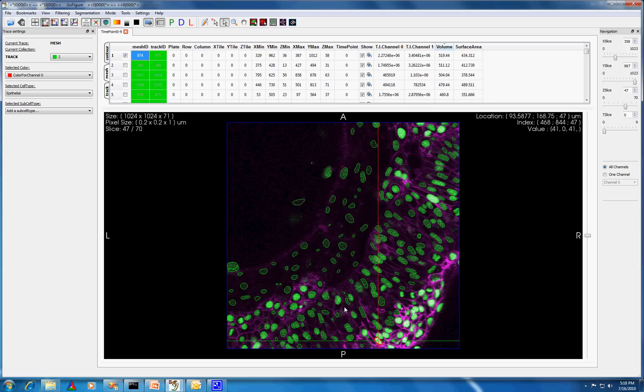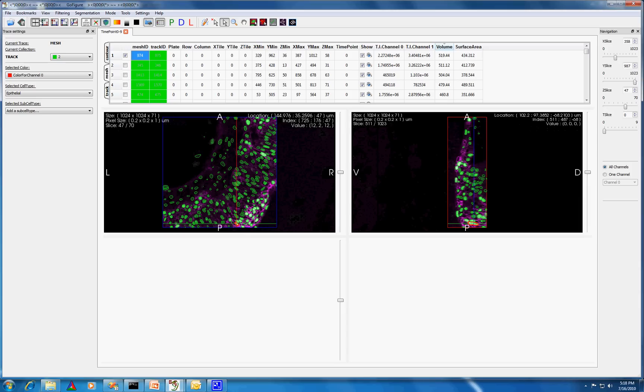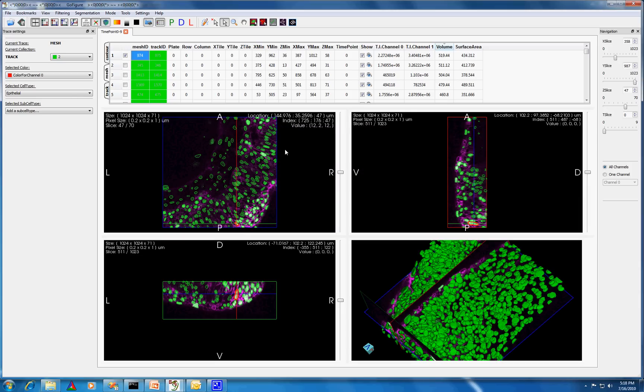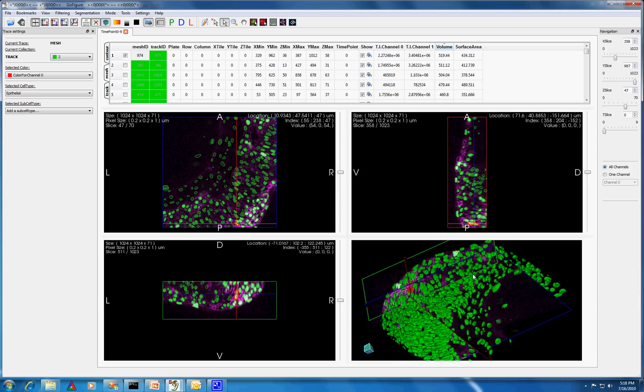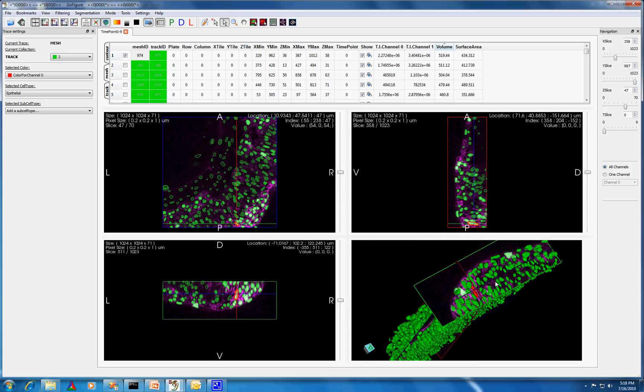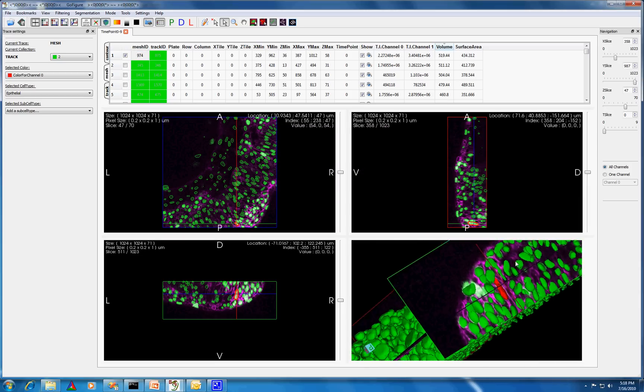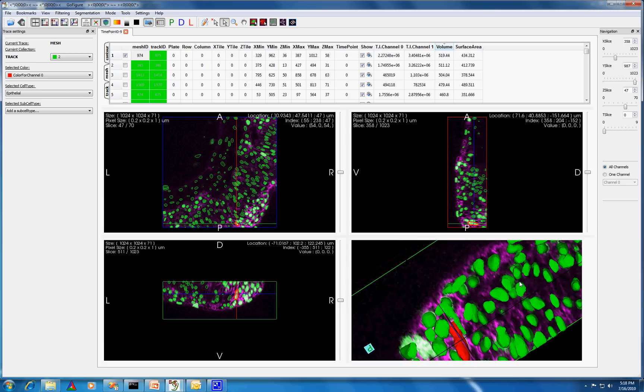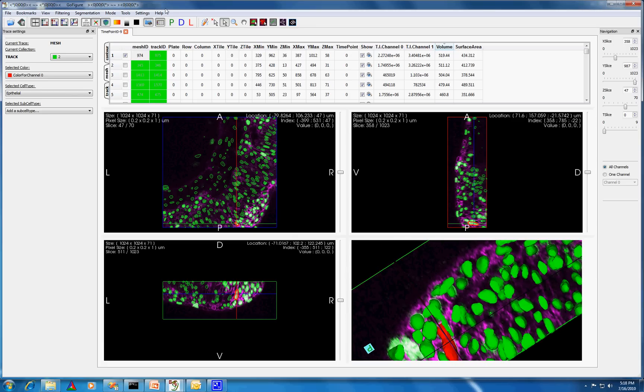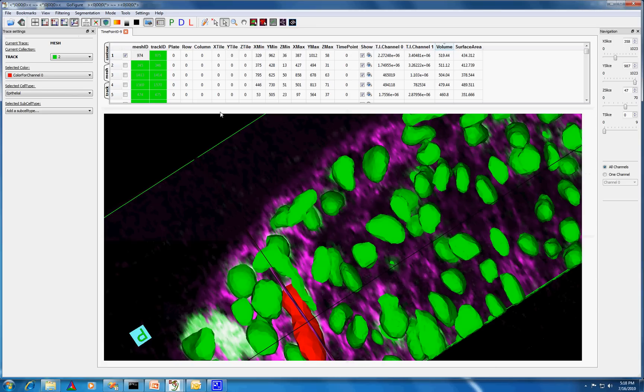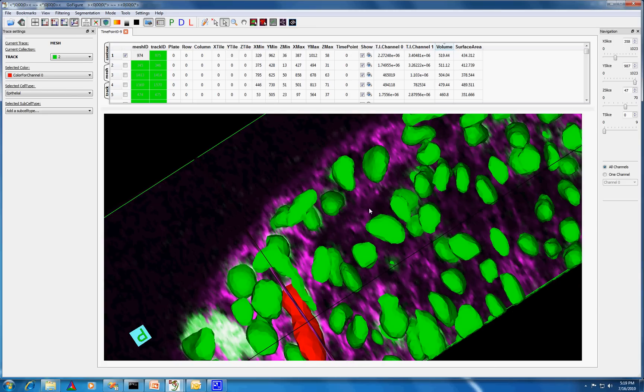Here you can see it highlighted in red in all four views. You can also select meshes in the visualization itself using the Picking Meshes tool.